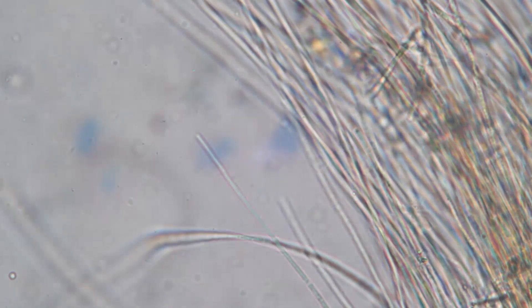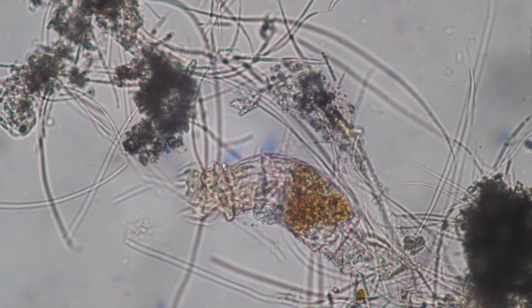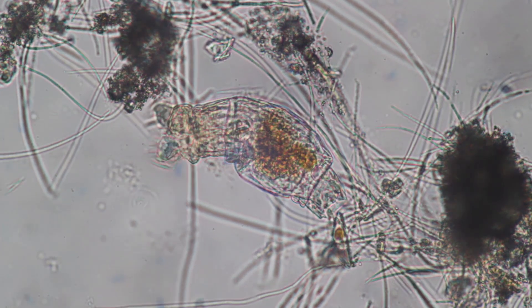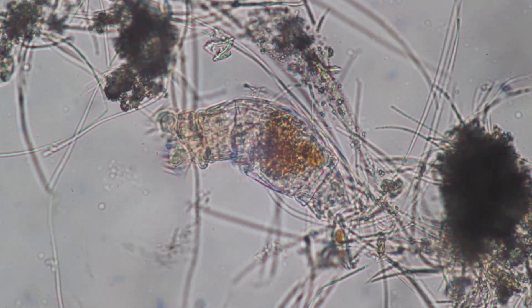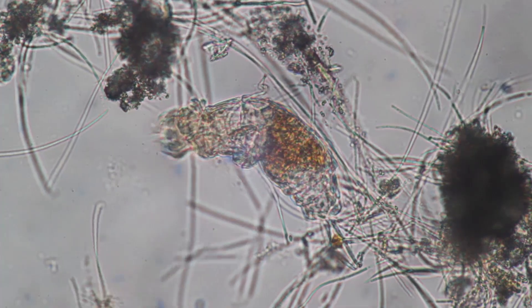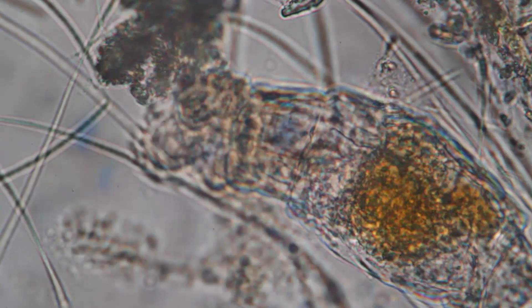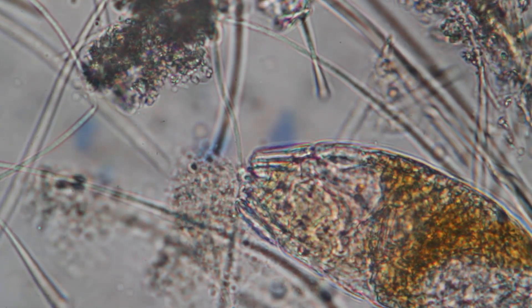I know this is not really what we normally think of when we look at bacteria, but as we all know there has been a historical confusion between cyanobacteria and algae. You can see a rotifer quite nicely, with the cilia beating and rotating quite rapidly, and all of the debris and cellular material floating in the water. You can also quite clearly see what seems to be a little heart beating. What I consider fascinating is that the color of these organisms seems to be influenced by their environment and by the food they eat.